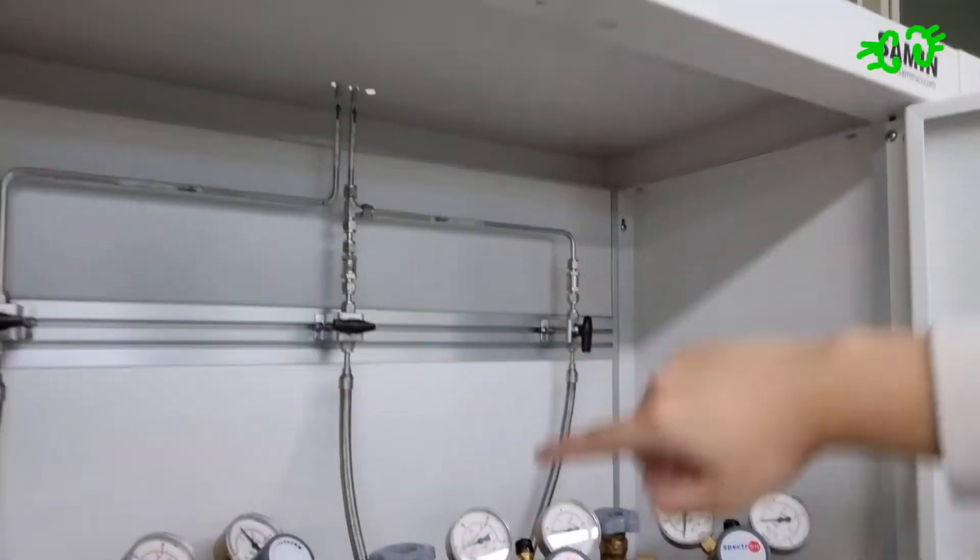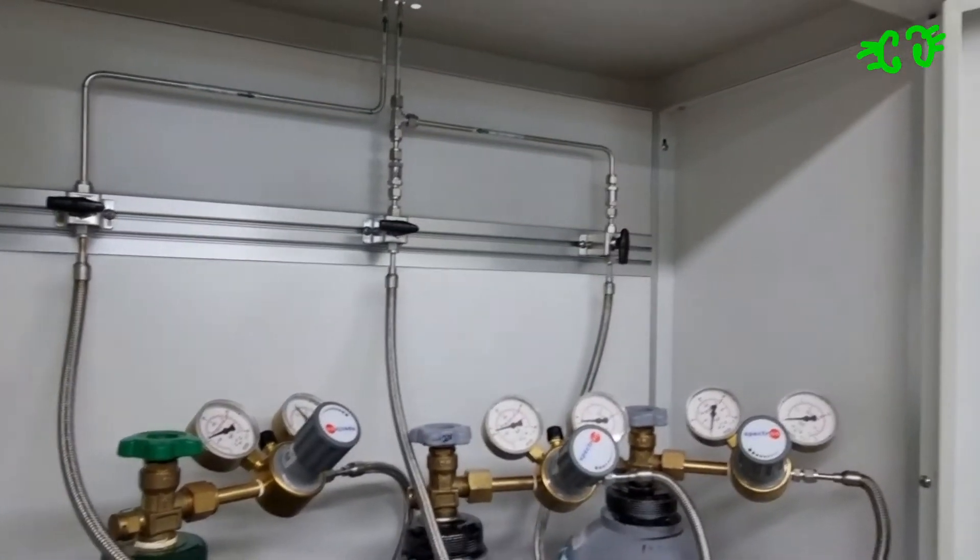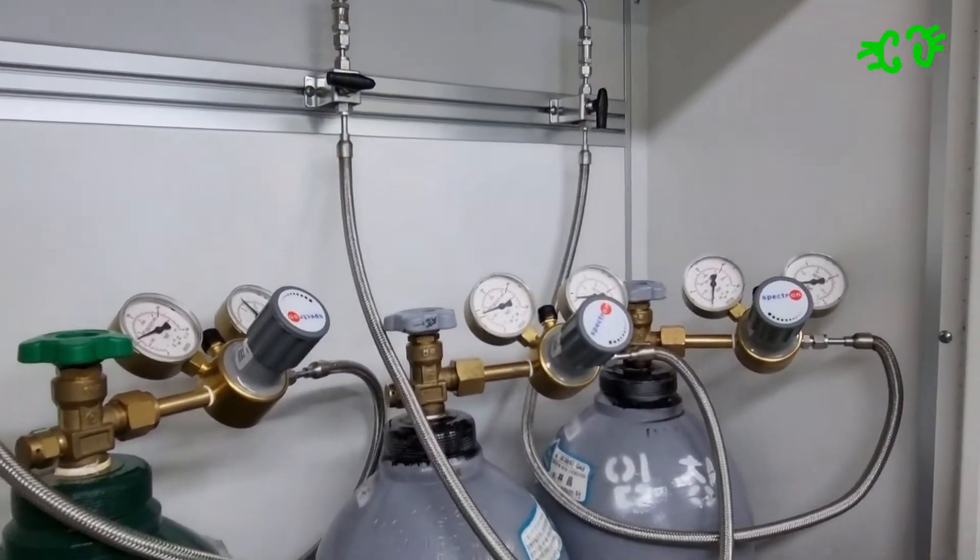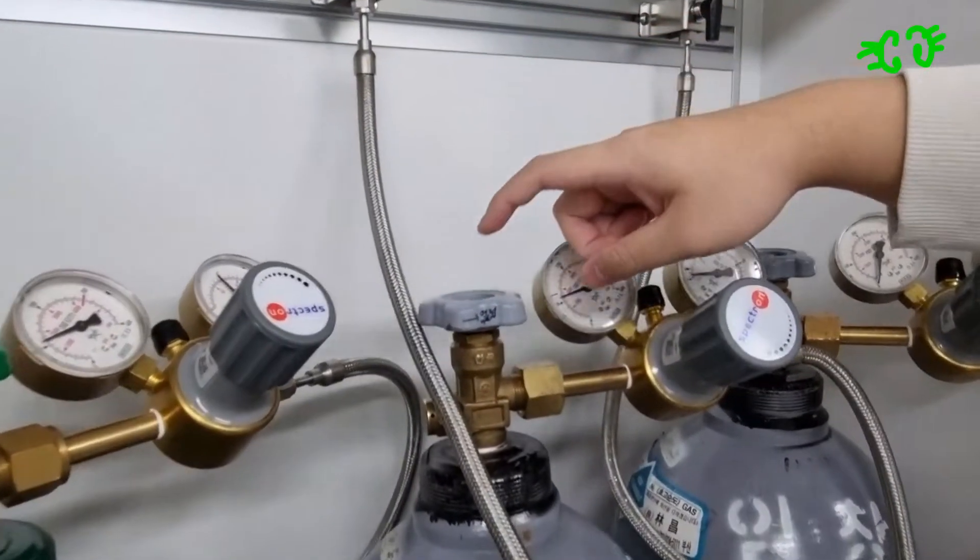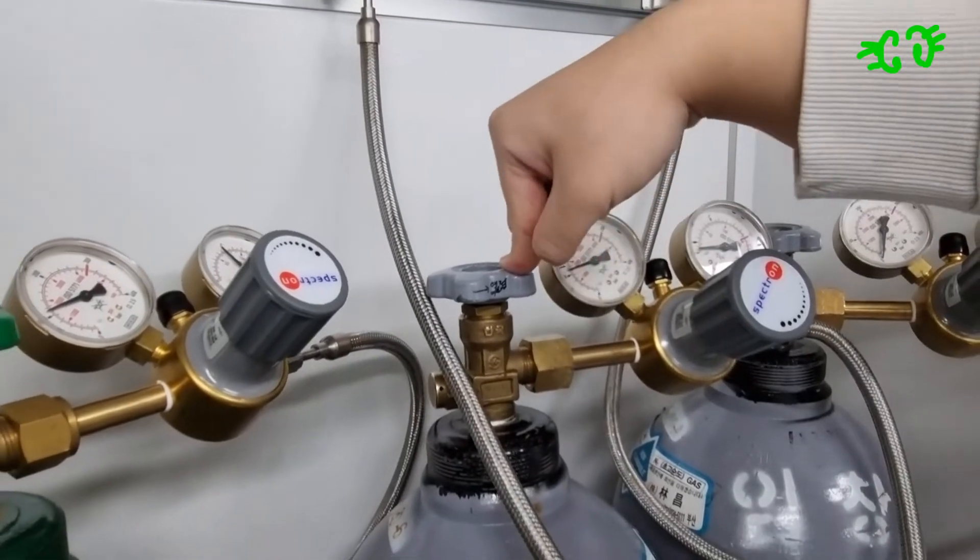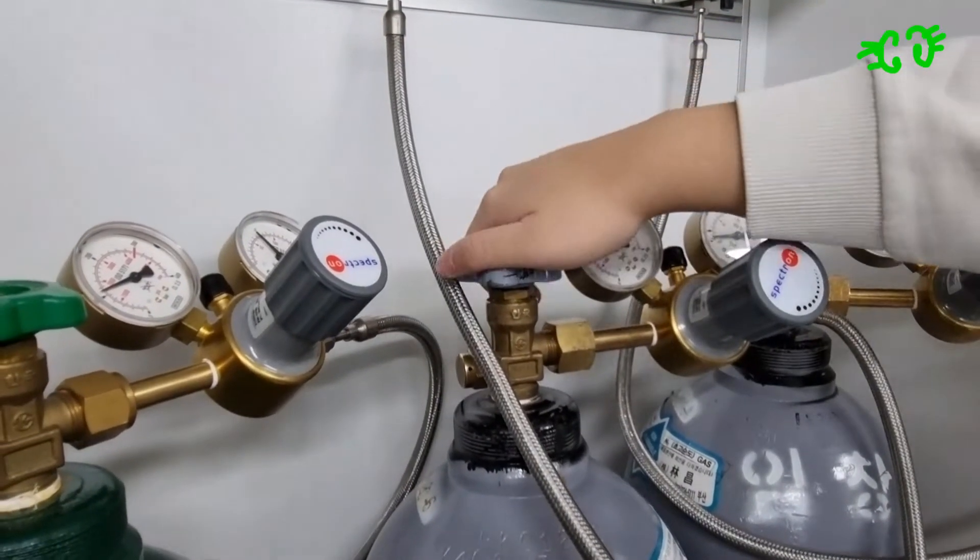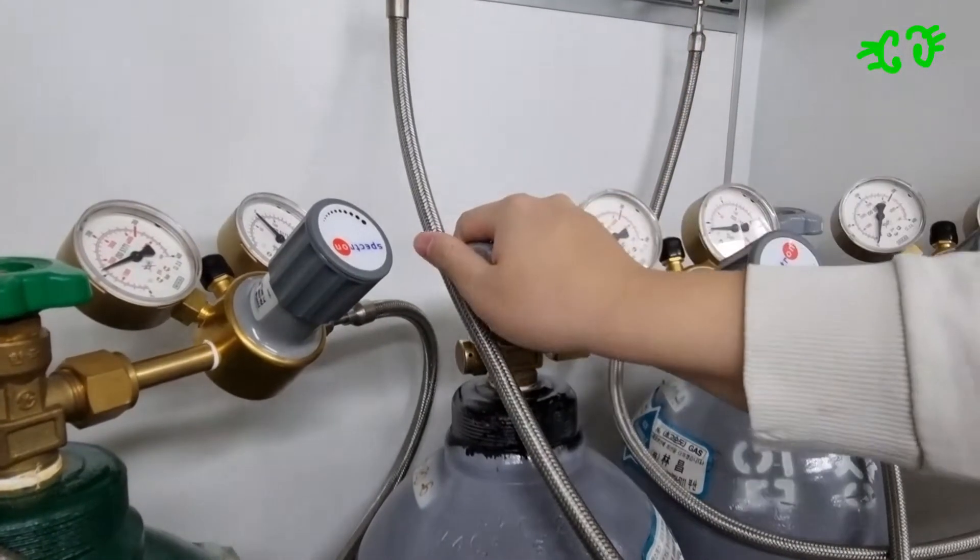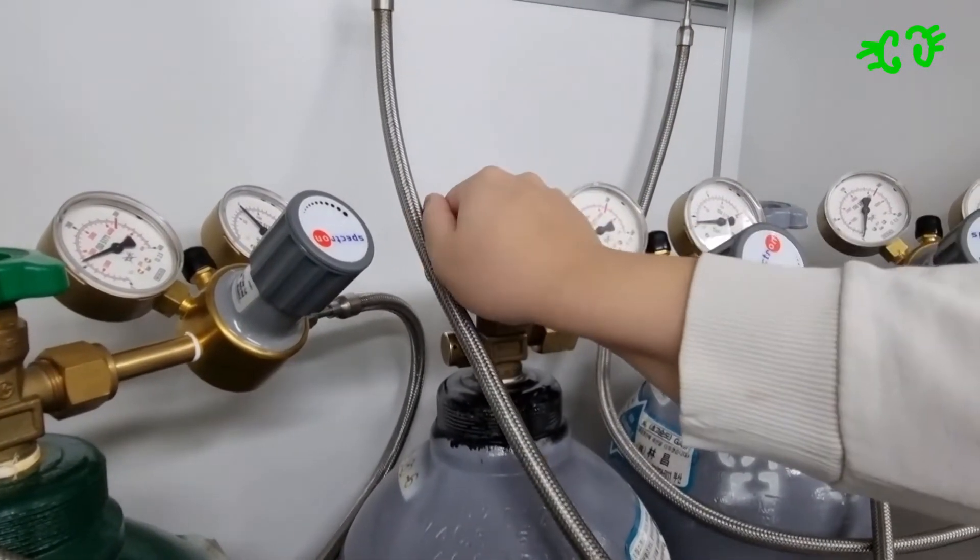You can see the tubes from here going up and connecting to that machine over there. So what we have to start with is opening the container. We twist it counter-clockwise to this side to open it. It's open.